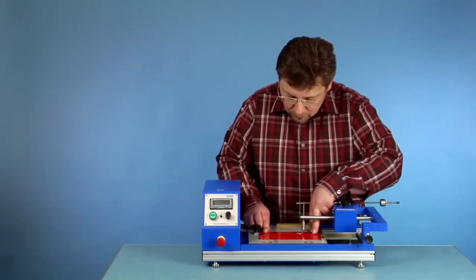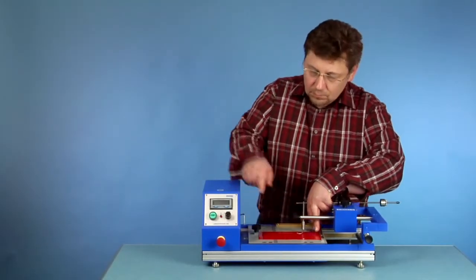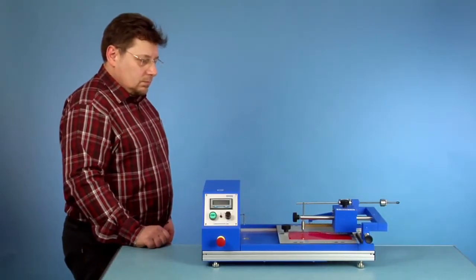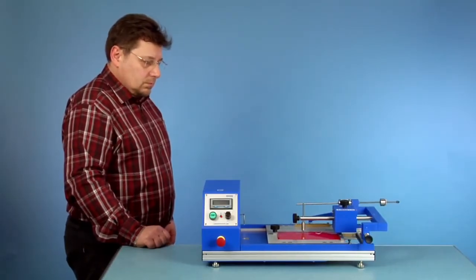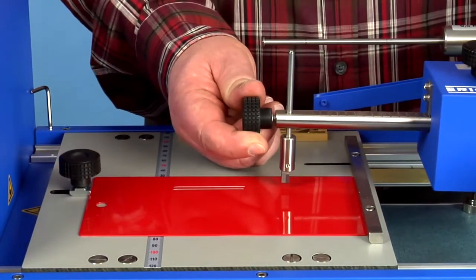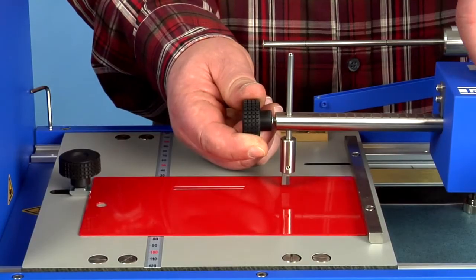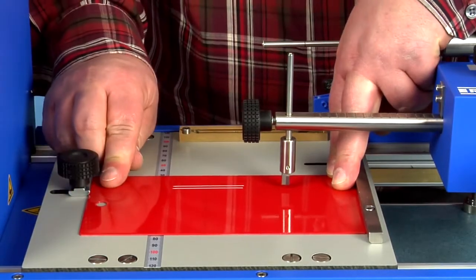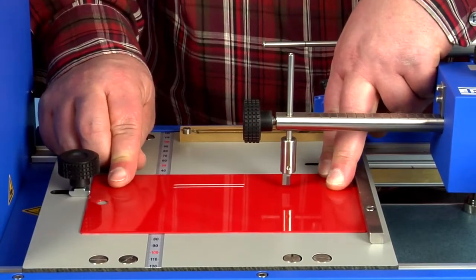The sample can be shifted a little bit for the next trace, starting the next scratching performance parallel to the first one with a changed scratch force. This process continues until there is no longer any trace visible.